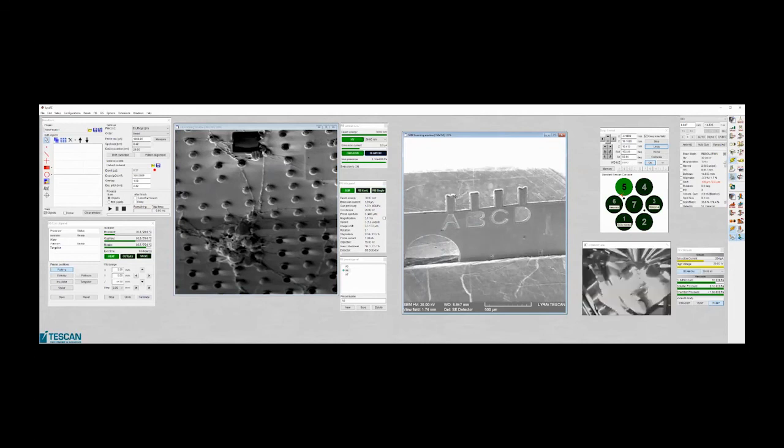So when you have, for example, a session for a longer time for TEM, you don't need to put it in, put it out. So it's better for vacuum, and you will have less contamination, etc. You are not manipulating the sample there and back, so there is less chance that you will destroy any of them. Yep.